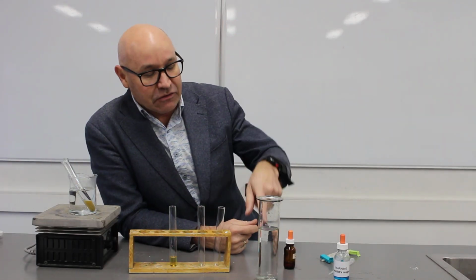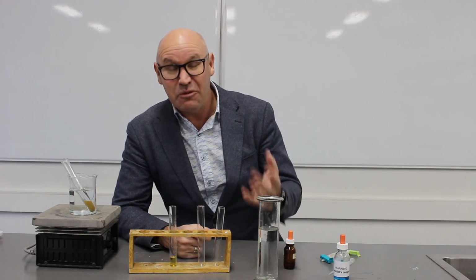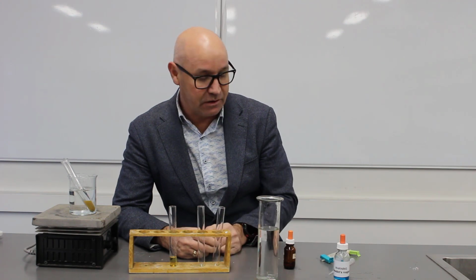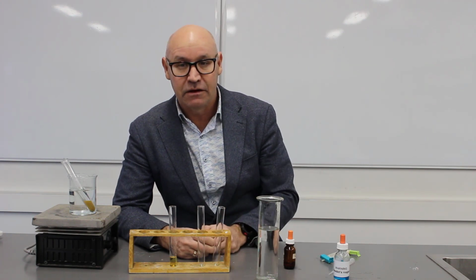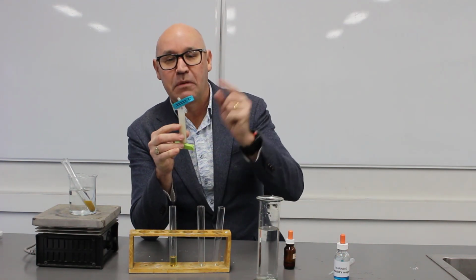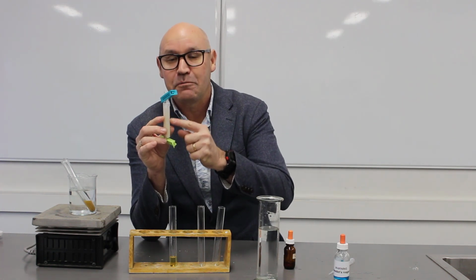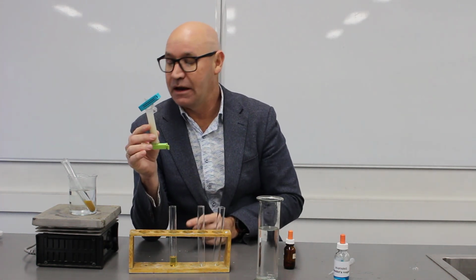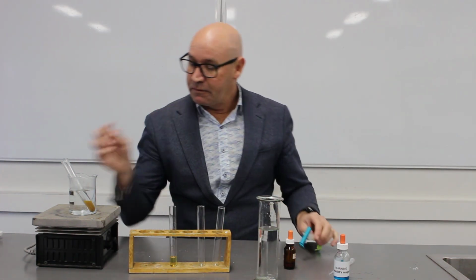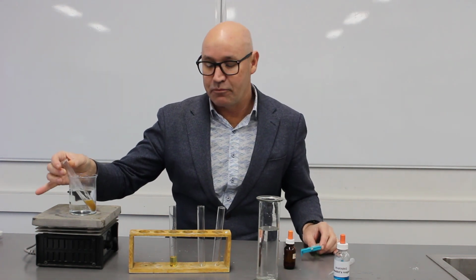Now, reminder, this is the water on the outside of the tubing. It was pure, plain, fresh water without sugar in it, without glucose in it. Now, 24 hours later, the glucose molecules from the bread are small enough to be able to diffuse across this membrane, this semi-permeable membrane, and go into this water. So that's what we're seeing here. And it's a relatively strong red brick precipitate.